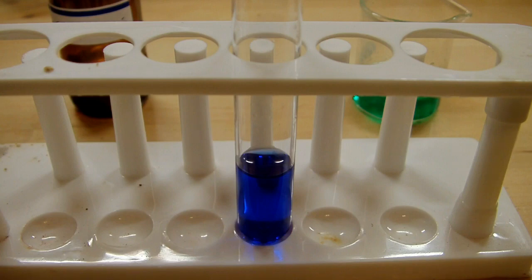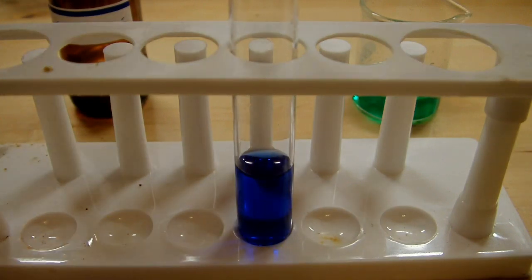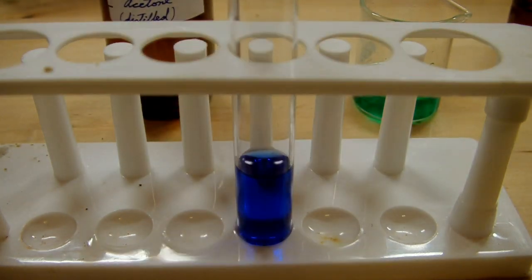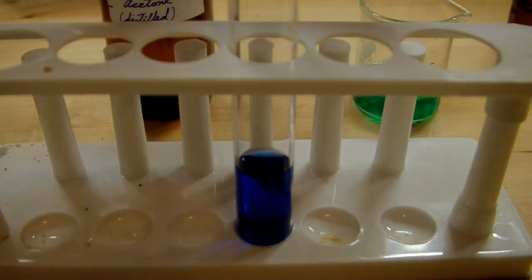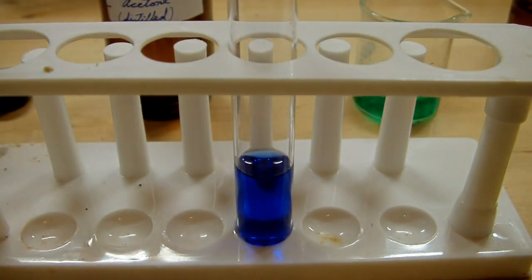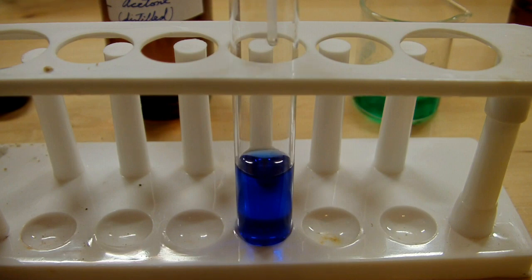So now we've got this really beautiful blue color of the hexaamine complex in solution. And now what we want to do is take it out of solution. That's where the acetone comes in. We're going to add the acetone, and what that's going to do is reduce the polar nature of the solution. Acetone is much less polar than water is. So once we add that, it should push the complex out of solution, and we'll get yet another nice color change.